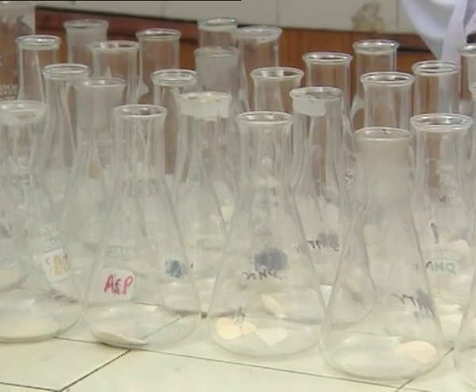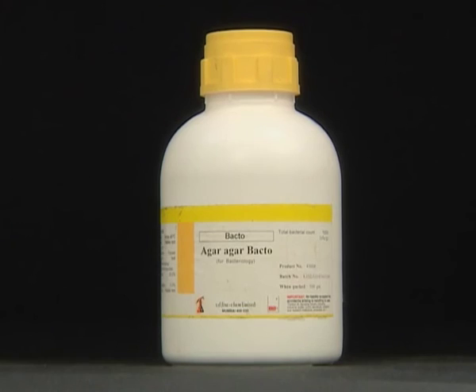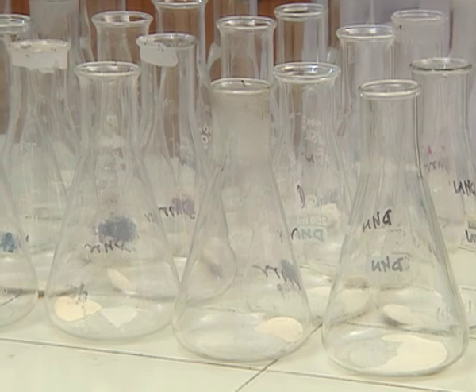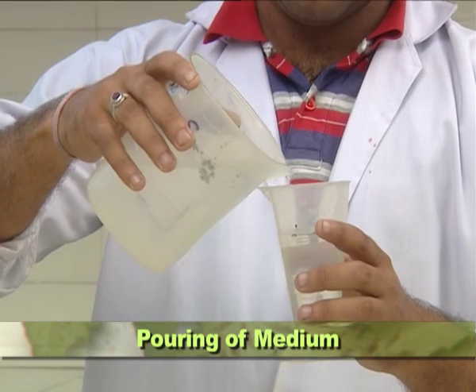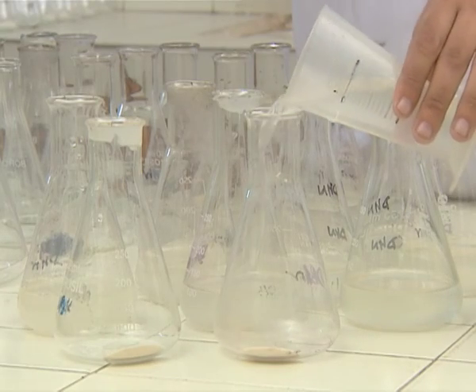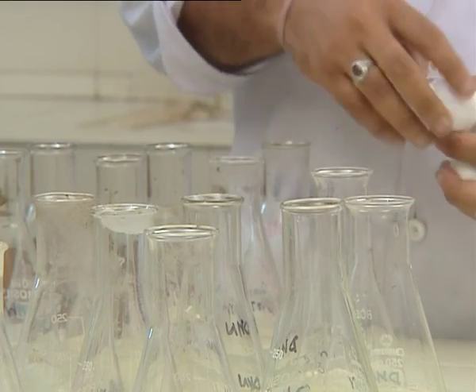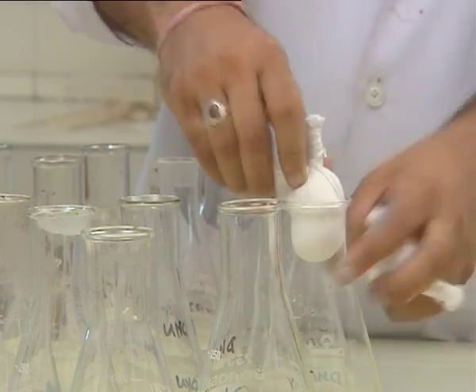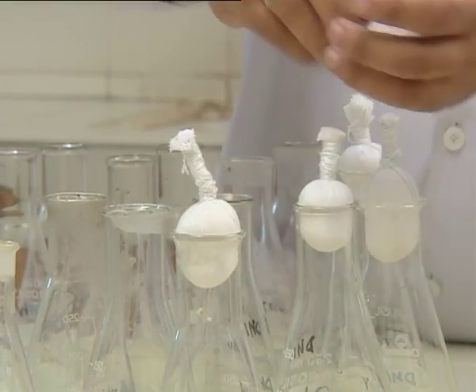Semi-solid medium has to be prepared. The method followed is to weigh 0.75 to 0.8 grams of agar-agar. This amount has to be optimized to provide optimum moisture to the cultures. Pouring of medium. 100 ml medium is carefully poured into each 250 ml Erlenmeyer flask and plugged using cotton plugs made of non-absorbent cotton wool covered with muslin cloth and tied at the top, allowing easy holding of the plug while inoculation.